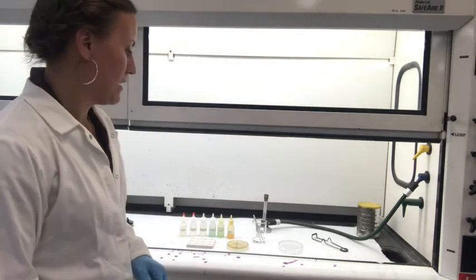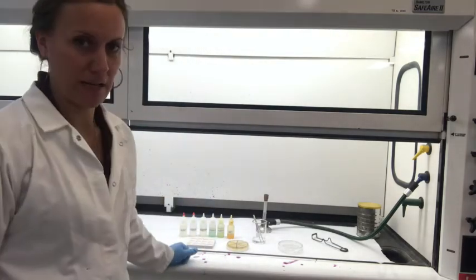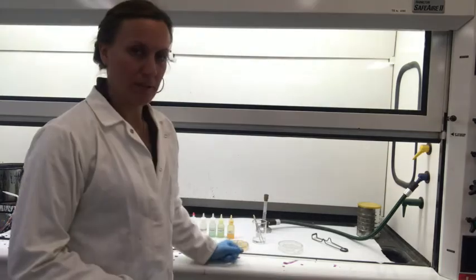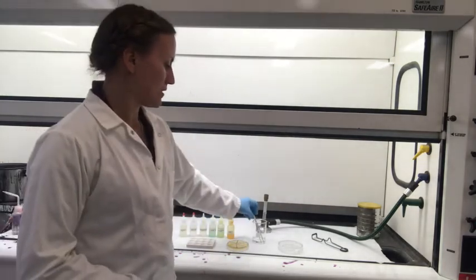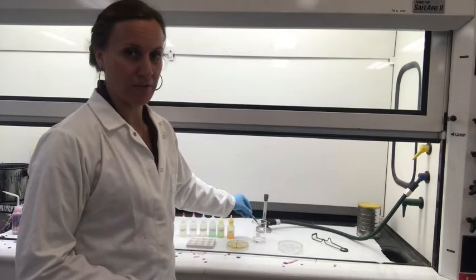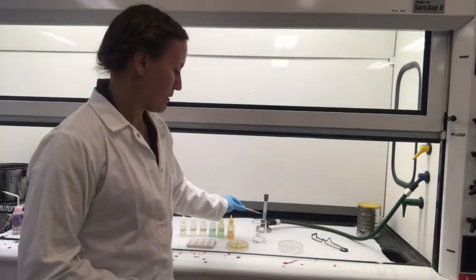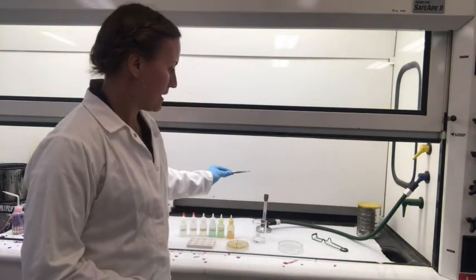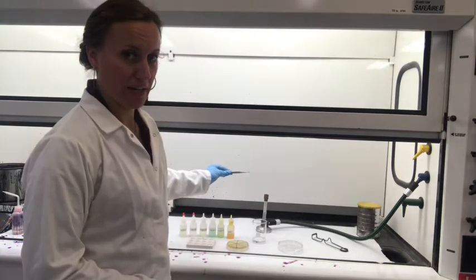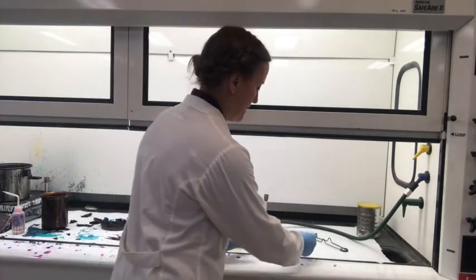I could use them, but that alcohol can also kill the bacteria or can cross-contaminate. So I have my open Bunsen burner flame in our chemical fume hood so that I can essentially eliminate that ethanol from these forceps. So to do this exercise, I start with my forceps. I'll simply pass them into the flame to burn off the rest of that ethanol. With this, I will take a sterile disc.